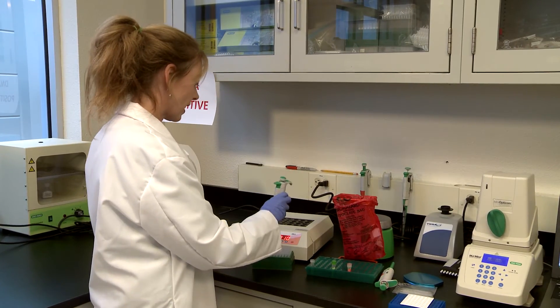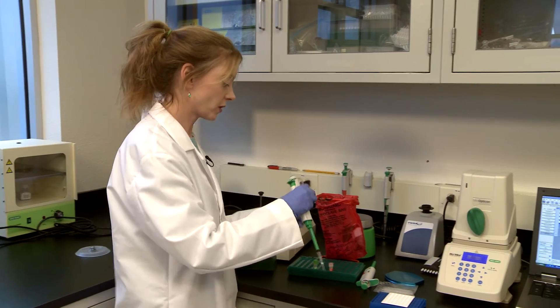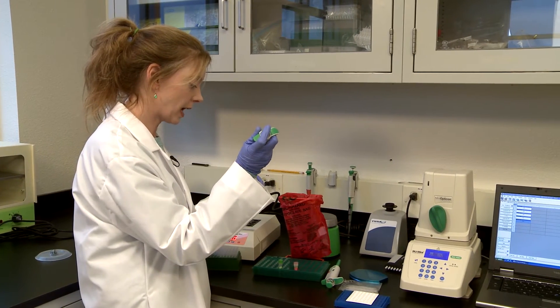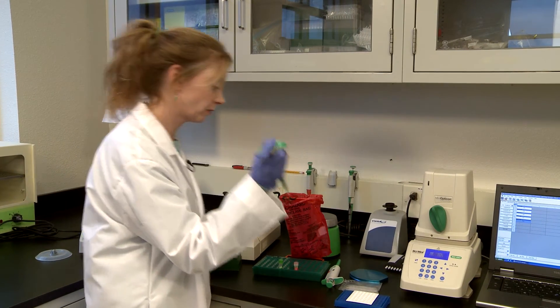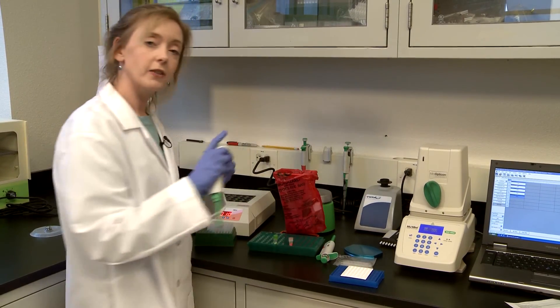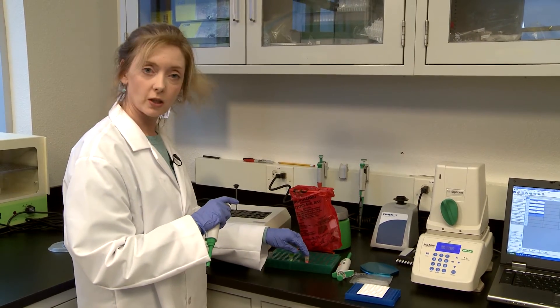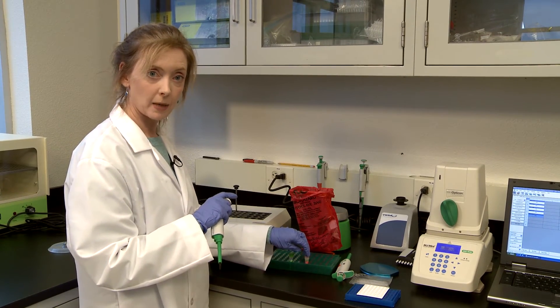We're now ready to add the samples — five microliters going into the wells that you've just filled with PCR mix. Be careful not to introduce any air. After you've added all of your sample, add your negative control and then your positive control last, to avoid any contamination issues.